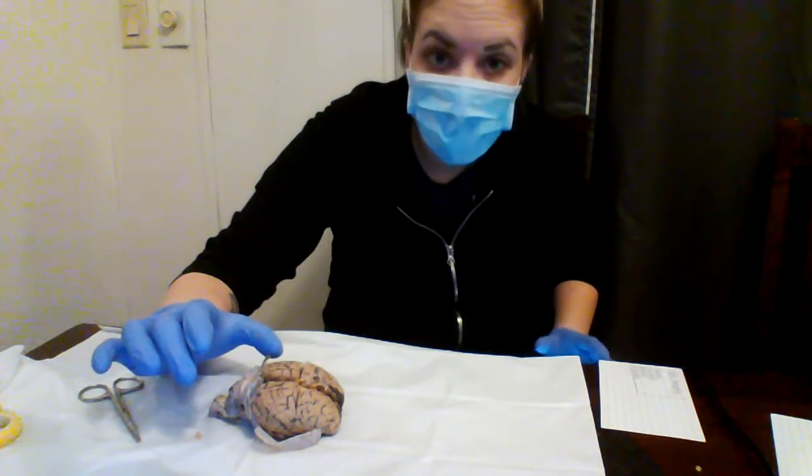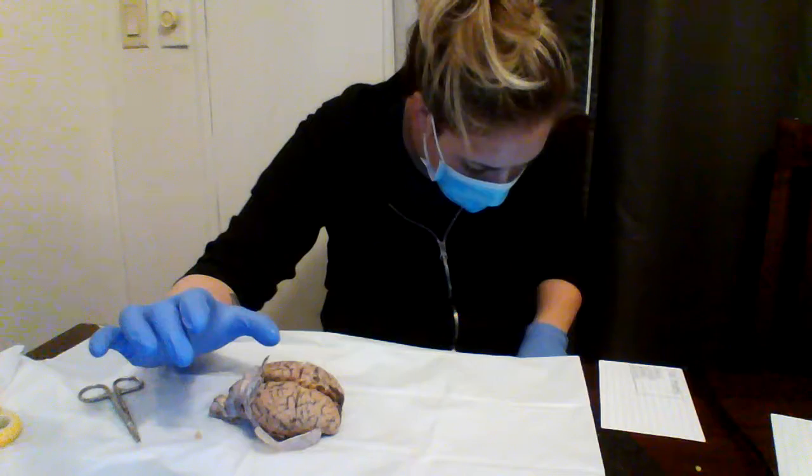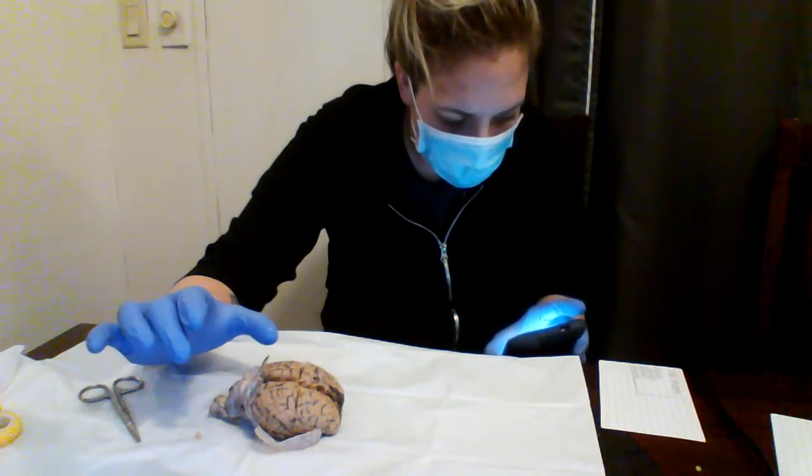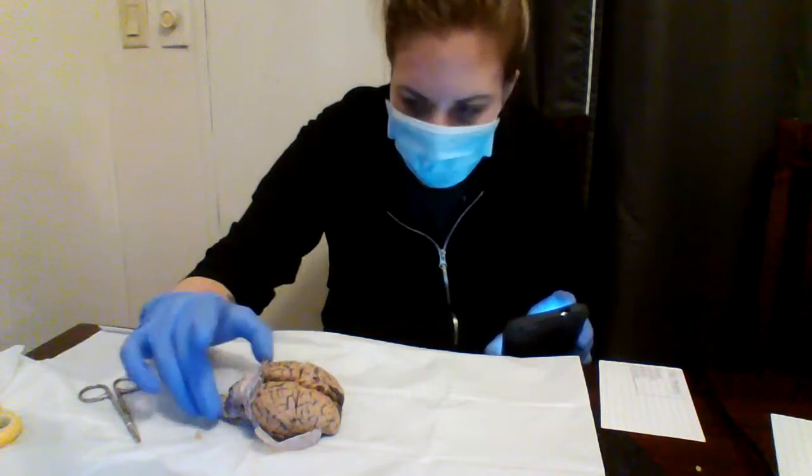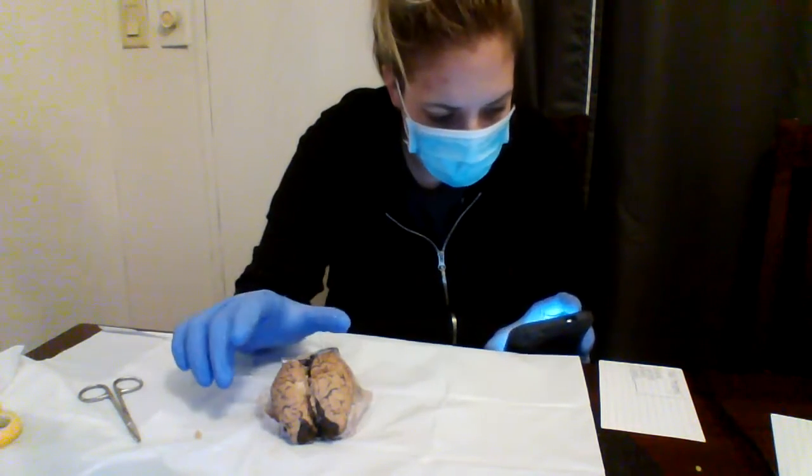The first thing we're going to go over is where everything is located on the sheep brain. If you turn it this way, it'll be a little bit easier to see.